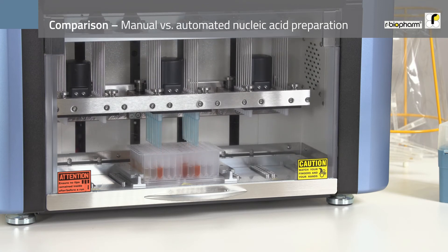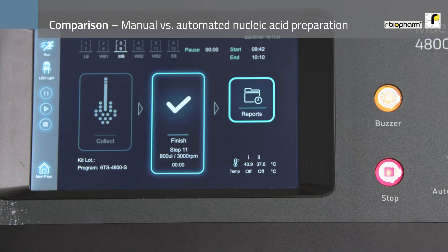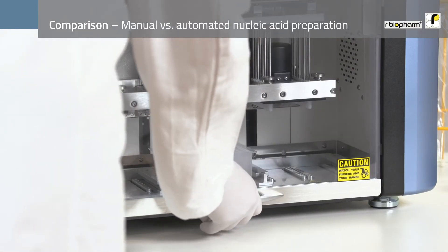When the extraction process is finished, you simply return and take out the eluted nucleic acid samples, ready for further analysis.